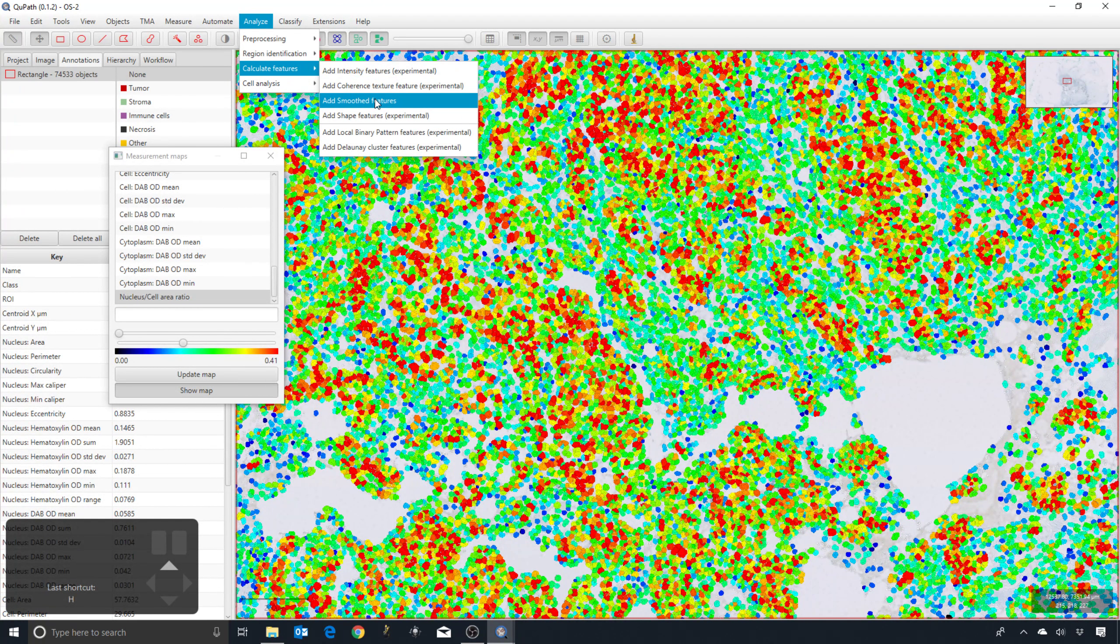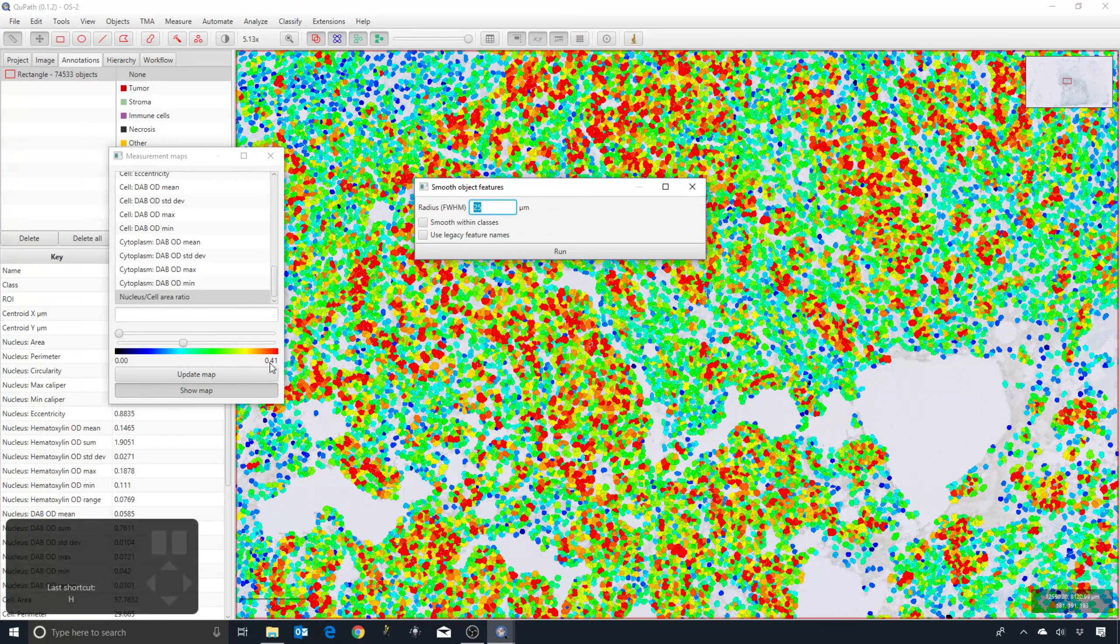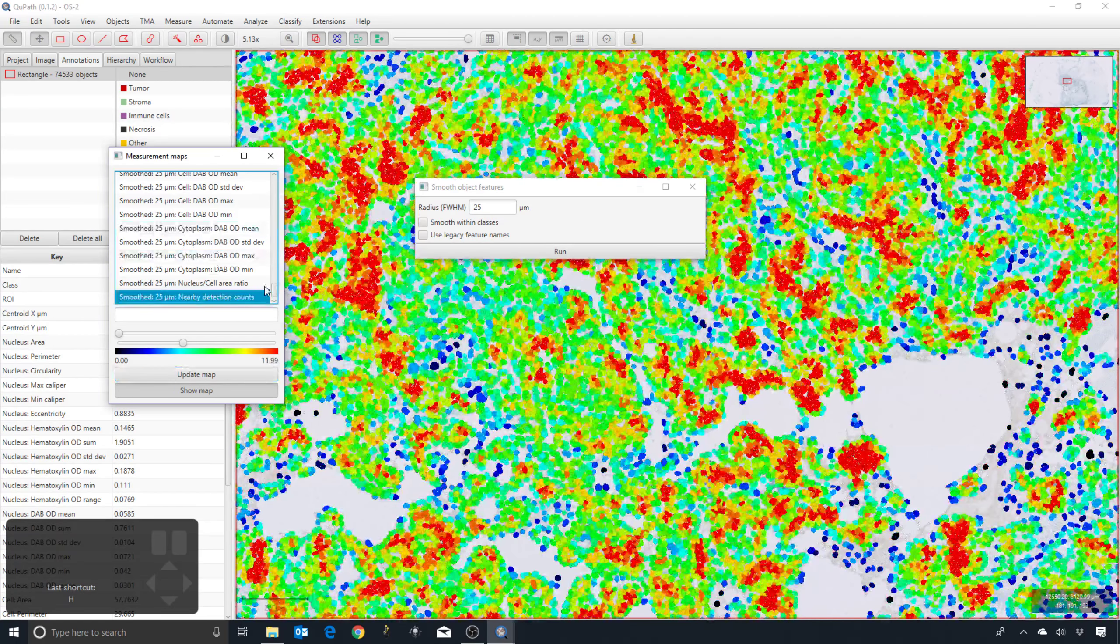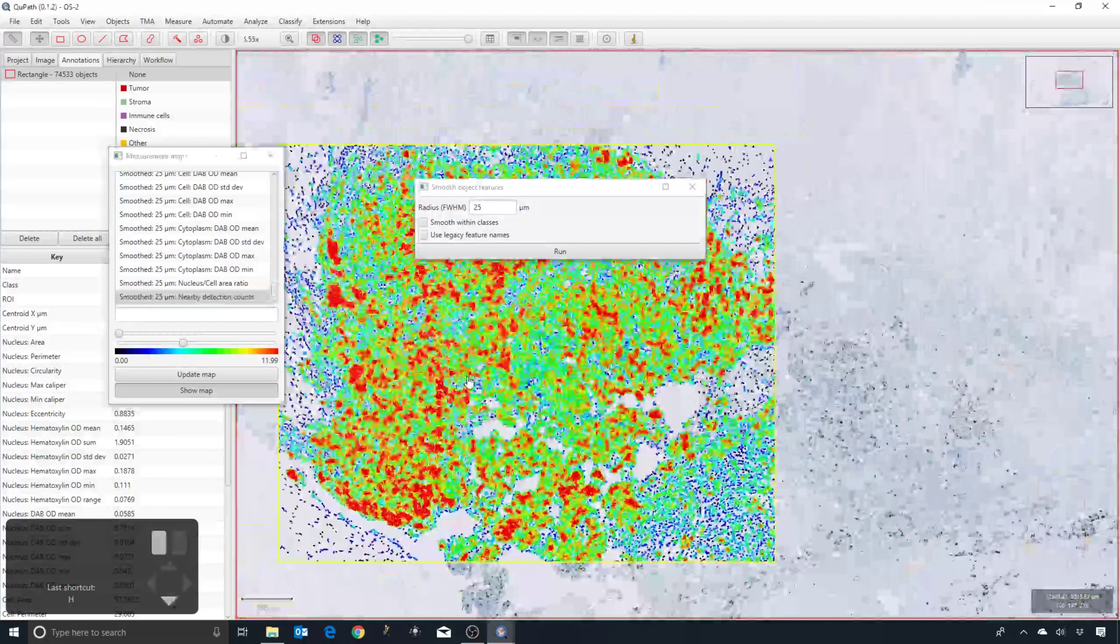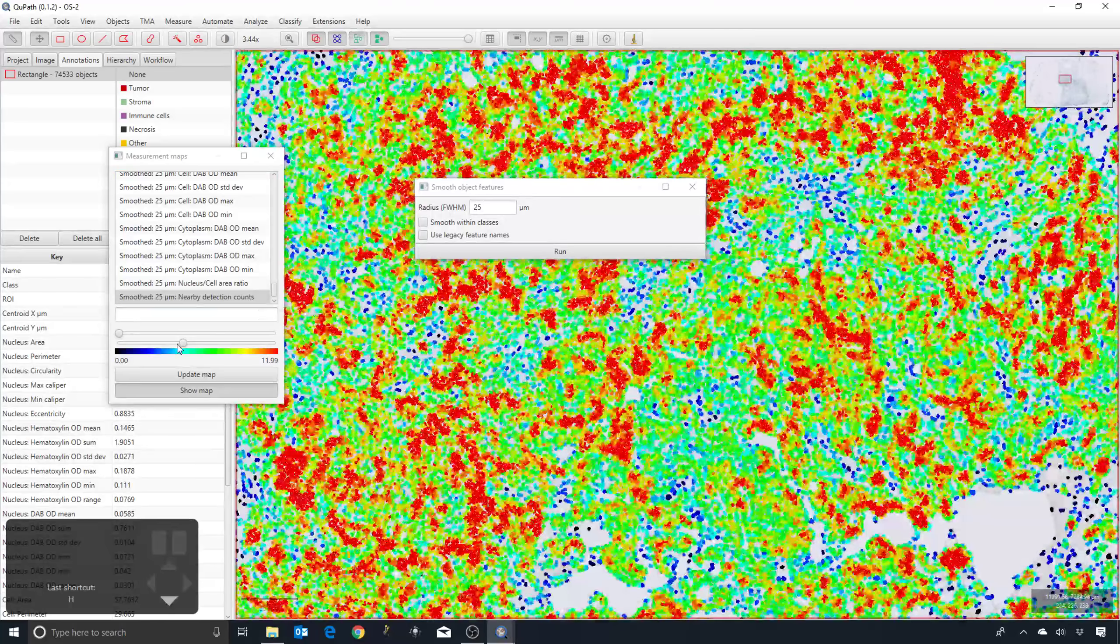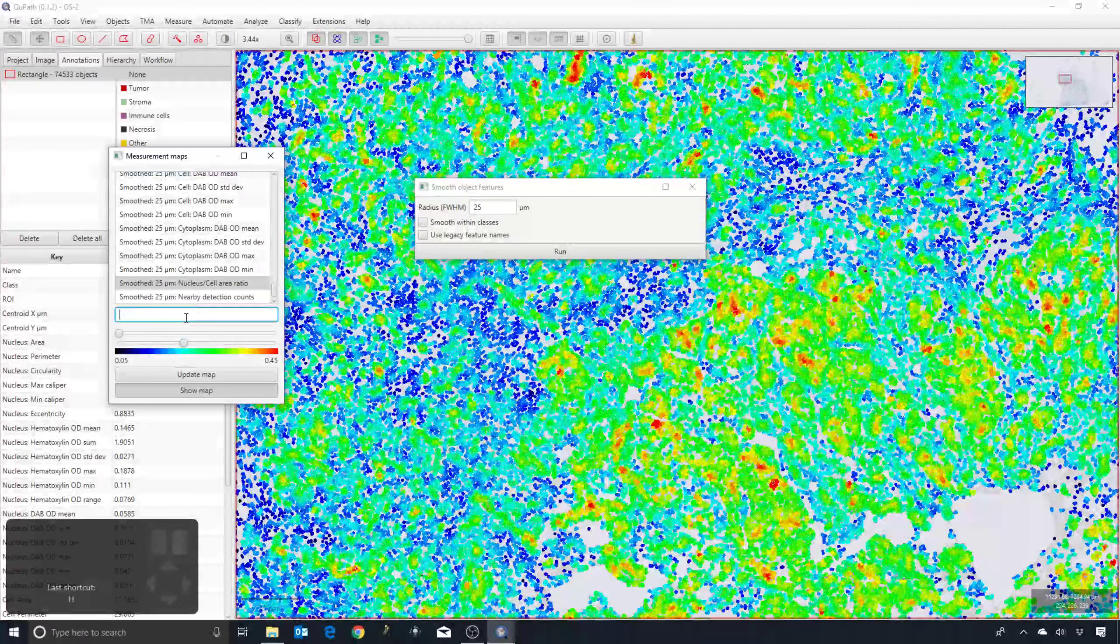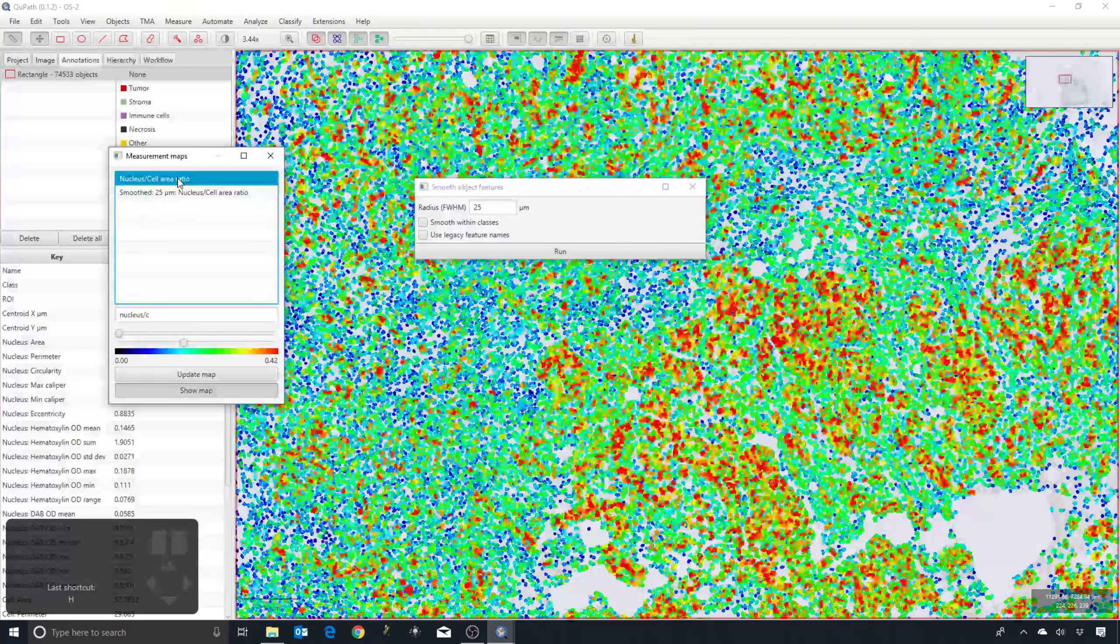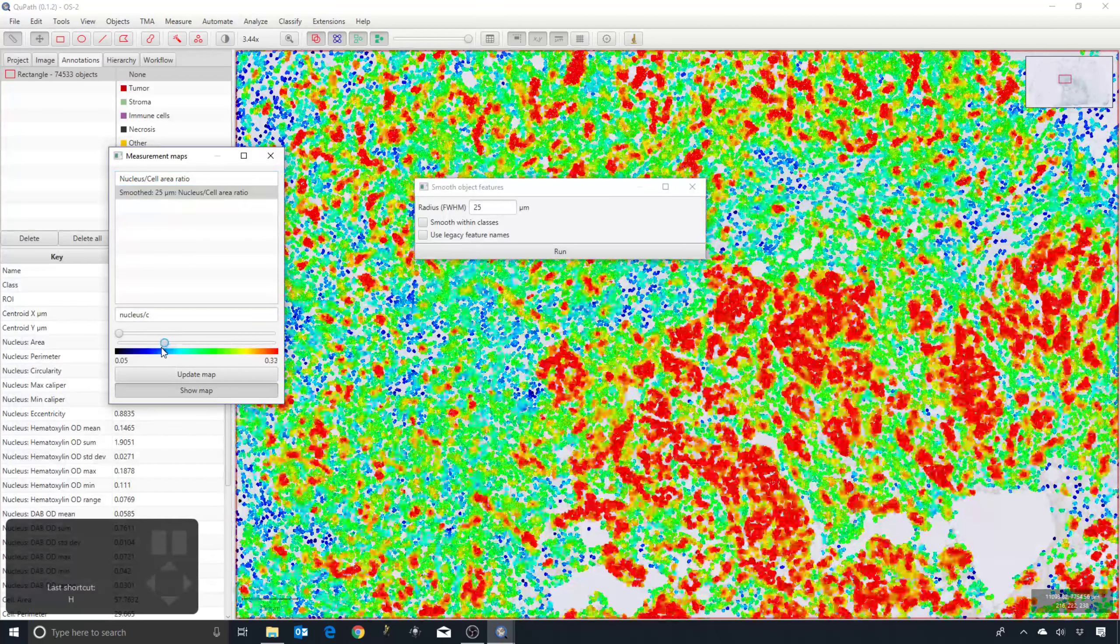I select a region, press run, and update the map. You can see what's happened is that it's calculated a weighted average for each measurement for each individual cell and the neighboring cells. So I filter down my list to get the nucleus cell area ratio. This is before the filtering; this is after the filtering. It's essentially smoothed out the measurements.